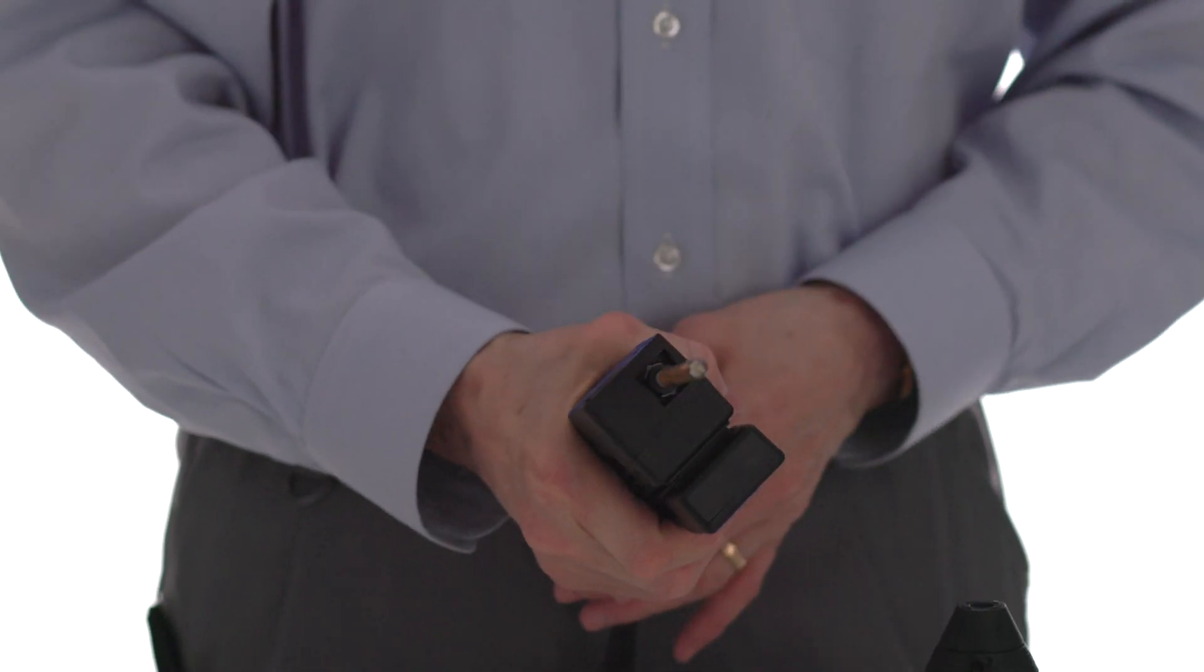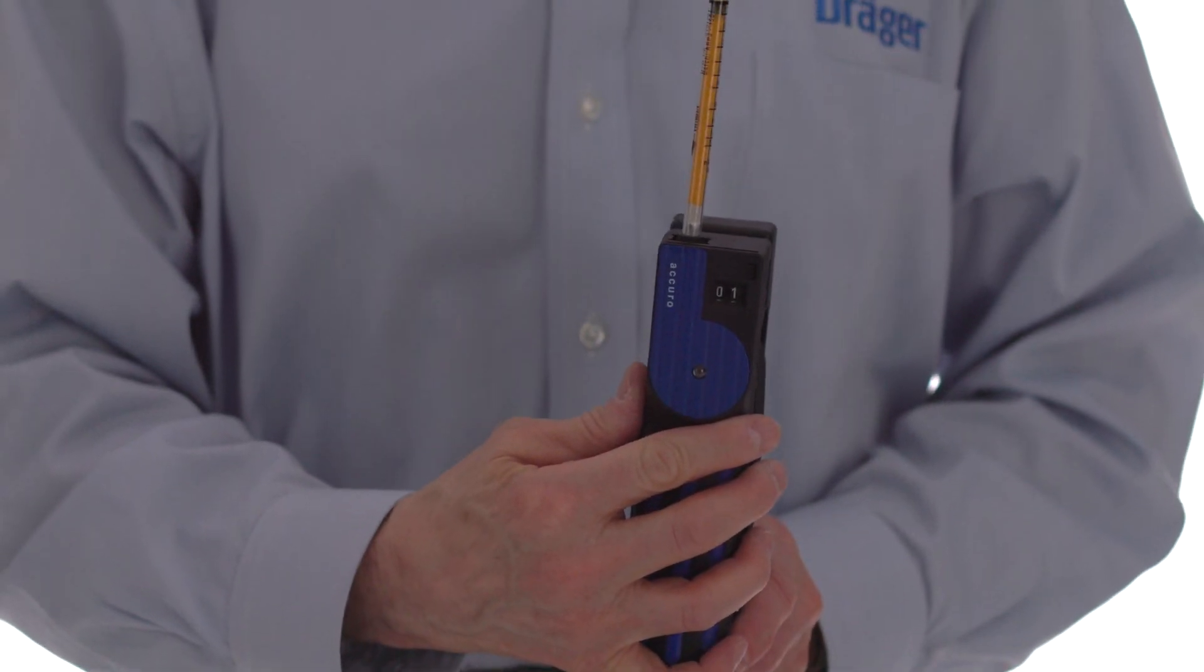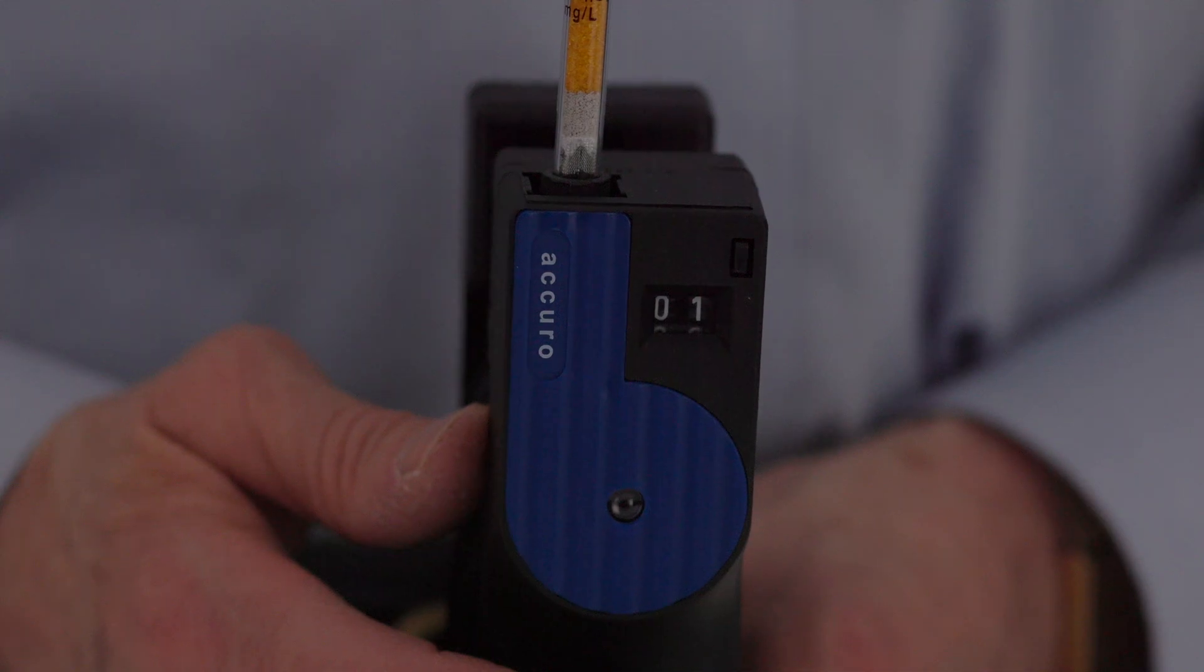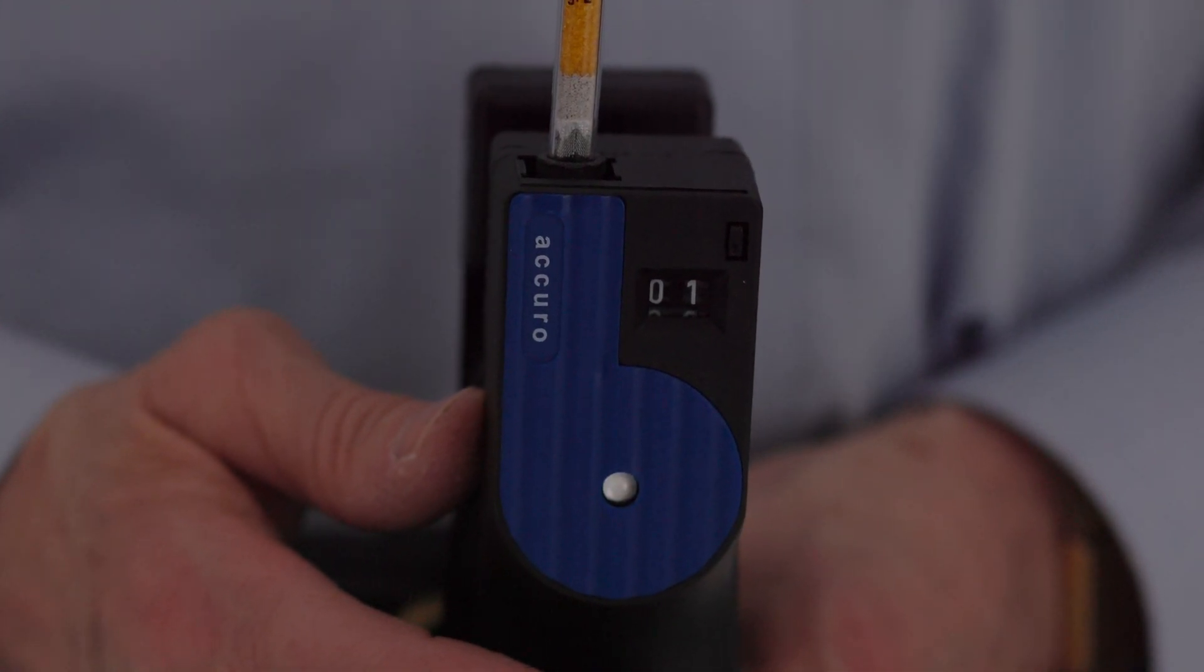Grip the pump and compress the bellows completely. The stroke counter will advance. Release the bellows and air will be pulled through the tube. The stroke indicator turns black when you compress the bellows and pops up white when the pump stroke is complete.